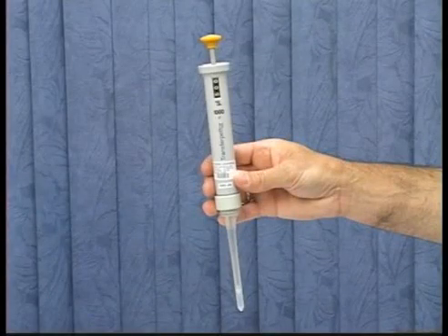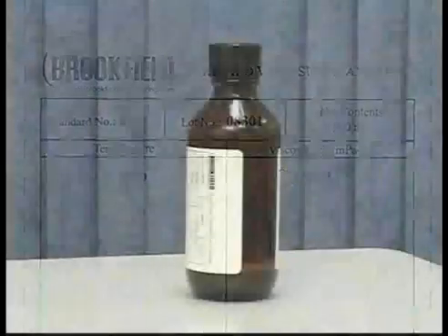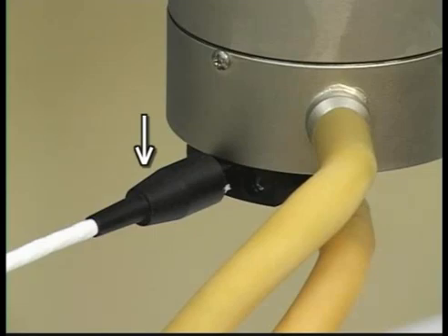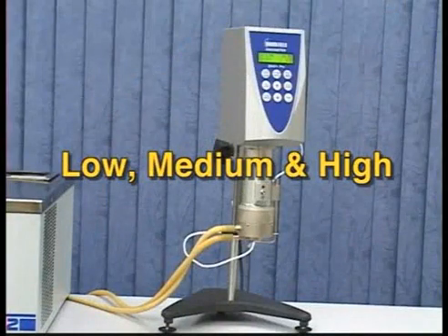The thicker the fluid, the longer it will take to equilibrate. For the 29.13 centipoise mineral oil fluid we are using, this should take approximately 10 minutes or less. The CPE-44 PY cup we are using has an embedded temperature probe which allows for temperature monitoring at the instrument. Based on the CPE-40 cone spindle we will be using, select three speeds that will give you a low, medium, and high torque value.